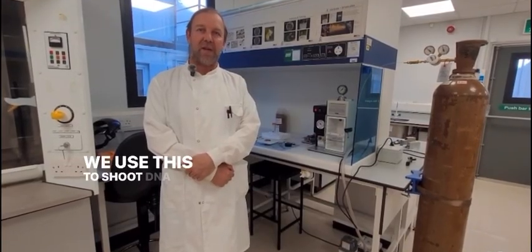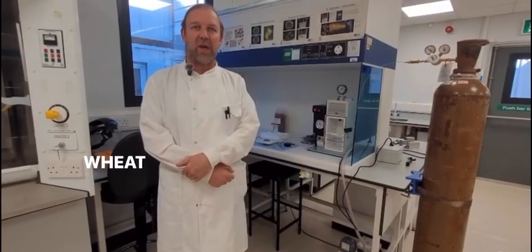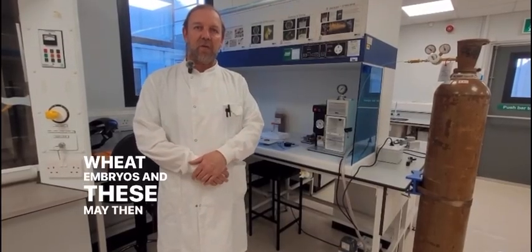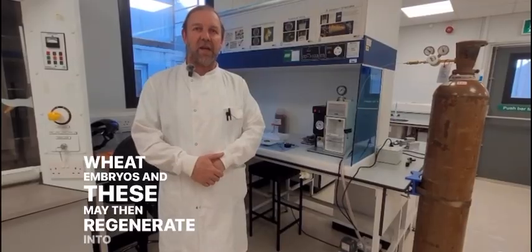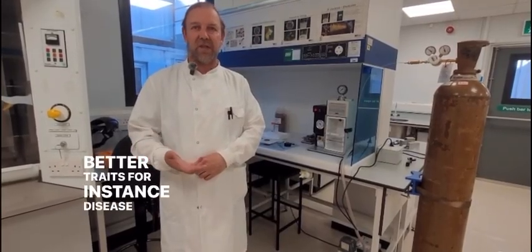We use this to shoot DNA into plant material, for instance wheat embryos, and these may then regenerate into plants with better traits, for instance disease resistance.